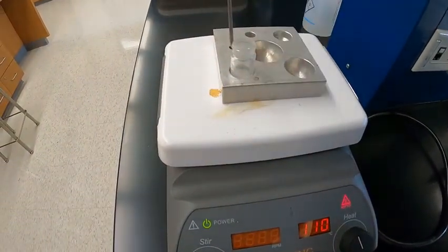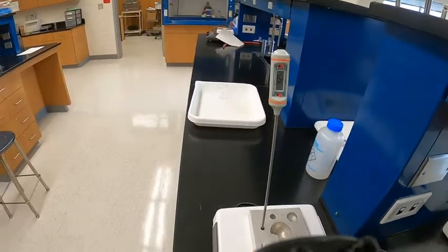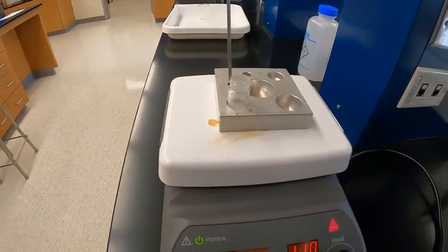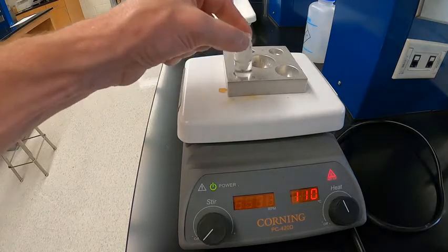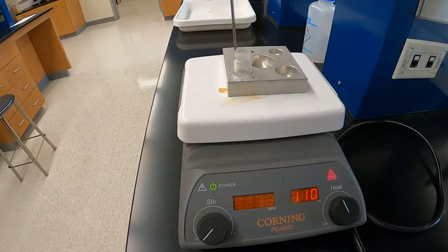And there's our reaction. We have a thermometer set up with the hot plate to monitor the reaction of the vial. So what this setup is, what's called an aluminum heating block on a hot plate. And what that aluminum heating block does, it allows us a place to put the vial safely so it won't tip over quite as easily. You can see there's our reactants in there. And it also provides like a heated jacket for the flask so that it stays warm during the course of the reaction, and therefore the reaction proceeds faster or better.